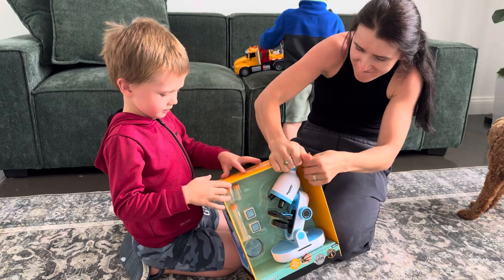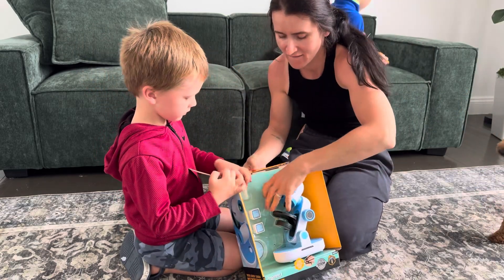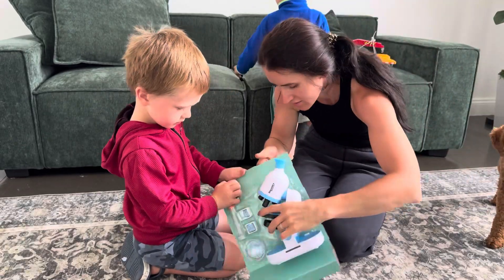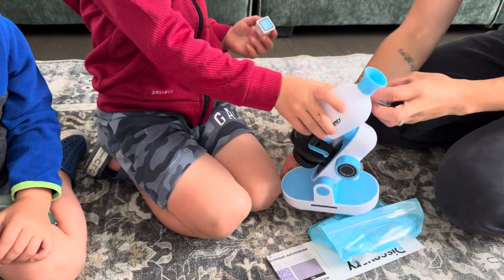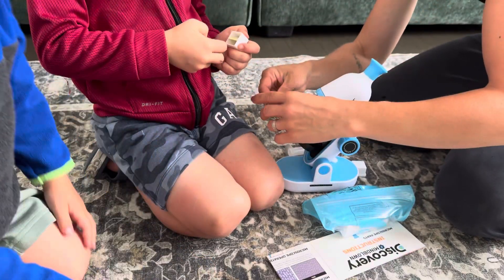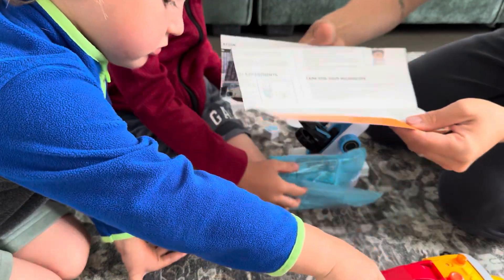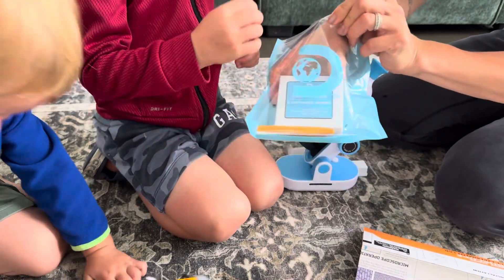This is so cool guys, let's open it up. So here we have the cube, we've got this dish that you put your specimen on. We also got the instructions and the slides — here are our slides.